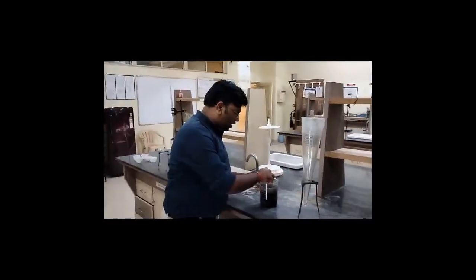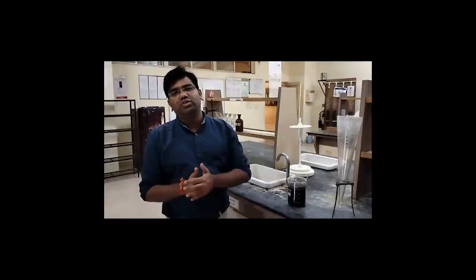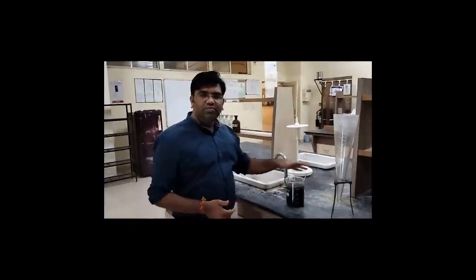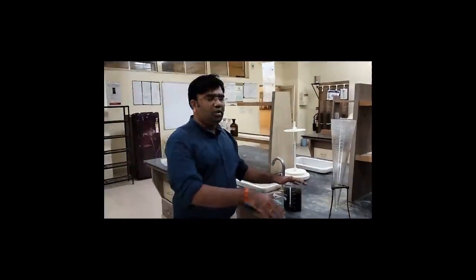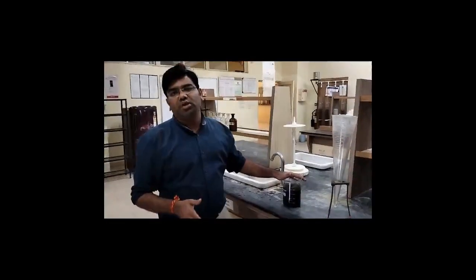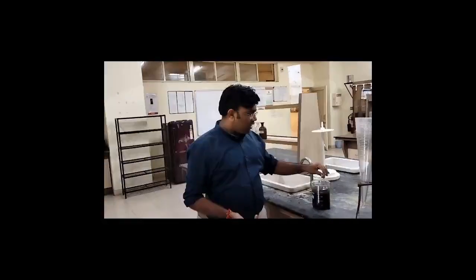This sample has been brought after the aeration process has been completed in the aeration tank in the STP. If you remember in the activated sludge process, this completely aerated wastewater is then passed to the secondary sedimentation tank for the settling purpose. So the amount of sludge that is going to settle in 30 minutes, that we are going to determine.